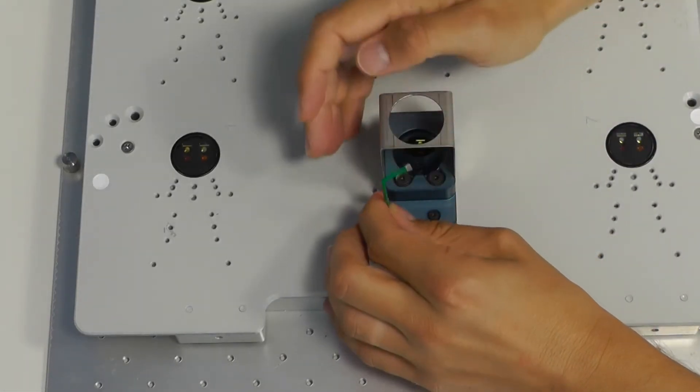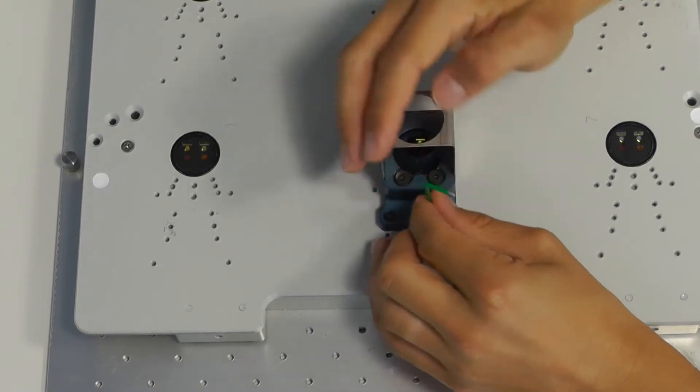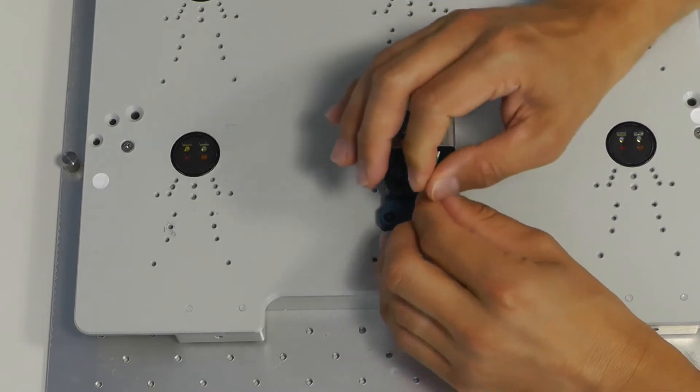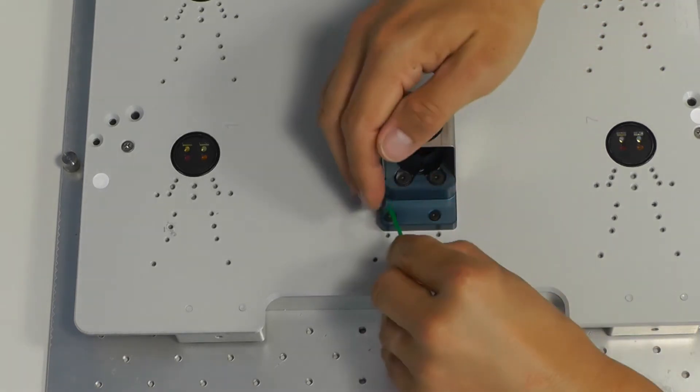Here you can see how the iTube adapter is attached to the SFR main unit. The adapter was designed to expand the range of applications for the SFR. Now it can be used with cell culture tubes with integrated sensors, so called iTubes.